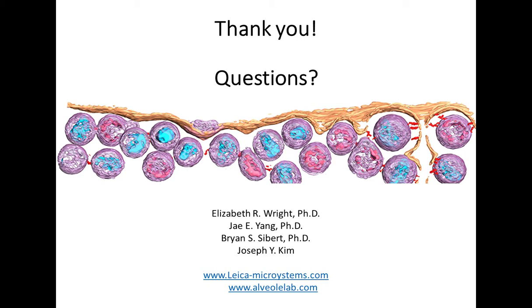Hi, that's a great question. Without micropatterning, the cells do grow randomly on the grid, except they have a preference to actually grow above the metal grid support bars where they can't be imaged. Without patterning, if you're very careful with seeding your cell density, you do get some grid squares that have a nice distribution of cells and that are well positioned for imaging. But micropatterning definitely enhances the number of cells that are well positioned for cryo-EM imaging compared to seeding the cells randomly on the grid.